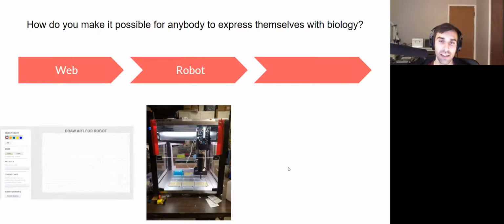Did the pilot program, did everyone just submit sketches, or were they using Protocol Designer or anything else? Was it just sketches? It was all done with something that looks a lot like the bioartbot.org website right now. So it's basically a grid where you click in parts of the grid and it makes colors.